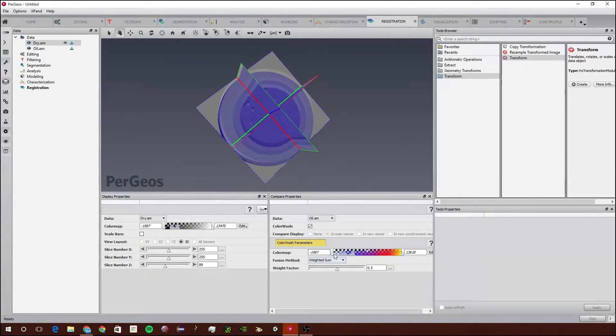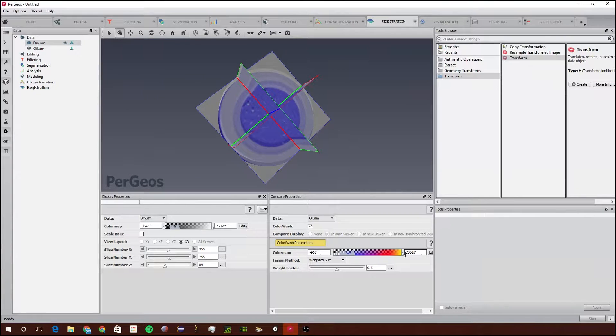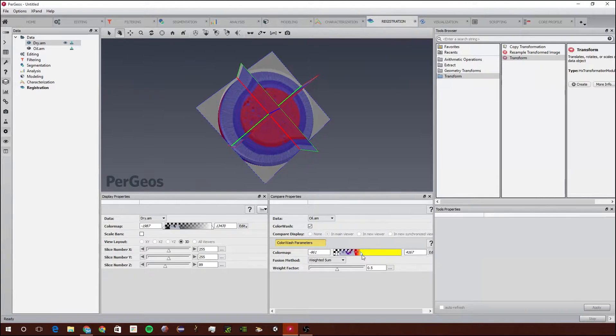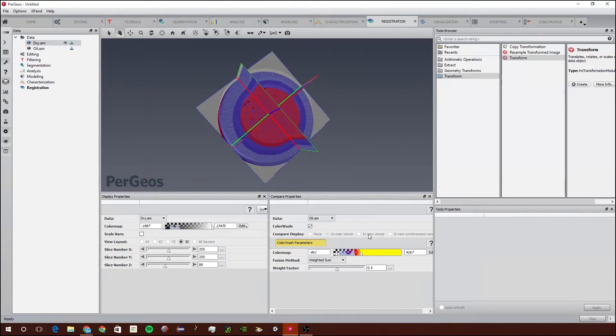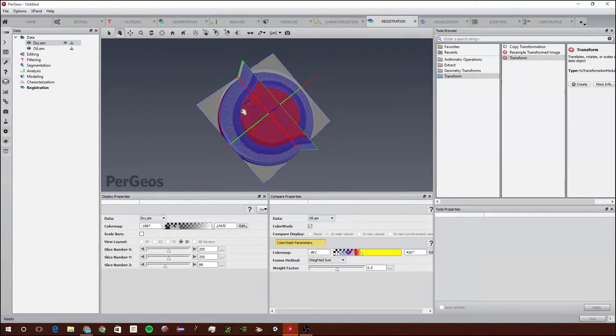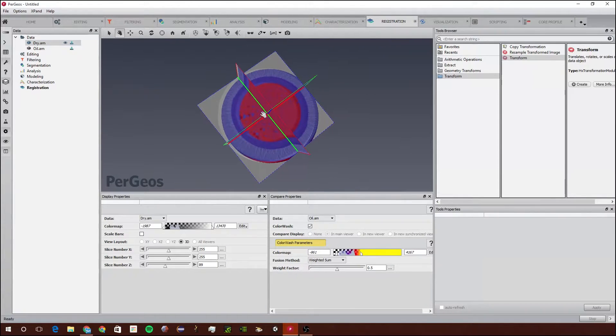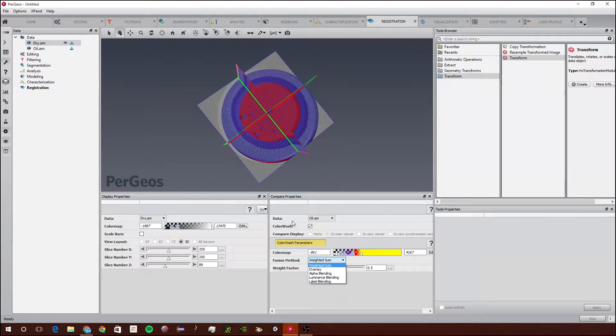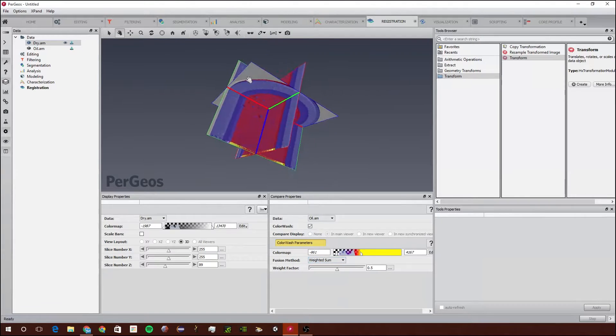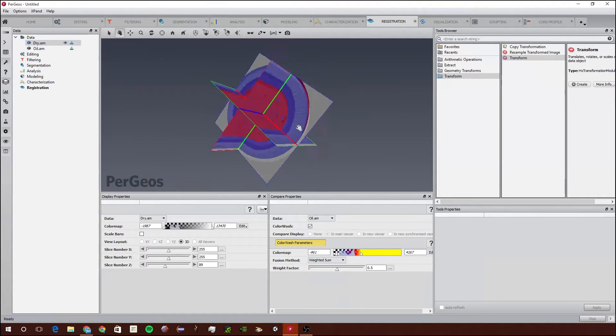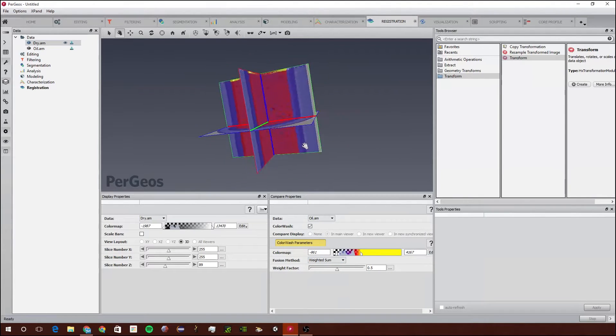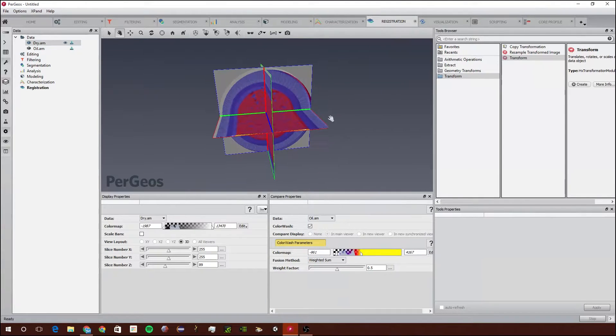With this one, it's washing the oil.am's values over the dry.am's values, and it's just adding them both together to get what we're seeing. They look pretty closely aligned, but let's say they weren't.